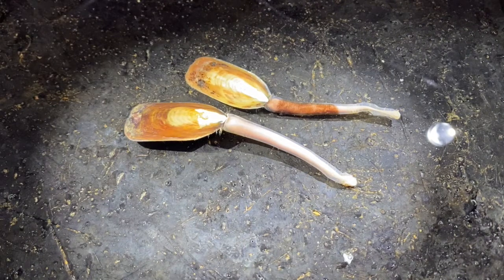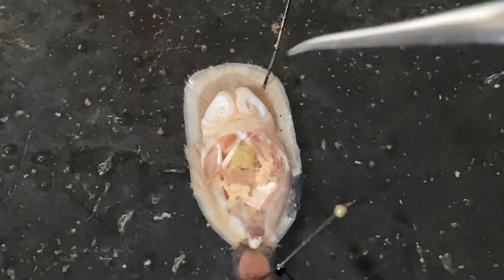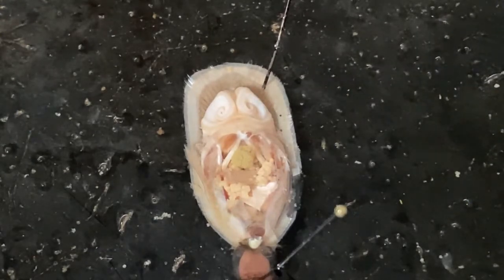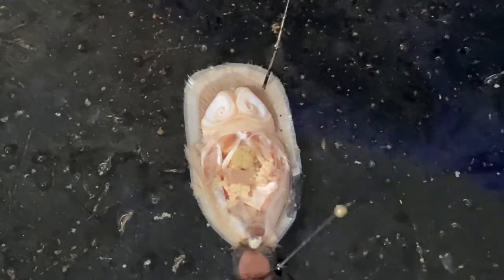All right, now we're going to take a look at the internal anatomy, and so I need to do some prep for that. Okay, to take a look at the internal anatomy, what I've done is remove the ventral shell. These animals, as you recall, have dorsal and ventral shells instead of left and right-handed shells that we find in bivalves. And the lophophore, which is this double coiled structure right here, is always attached to the dorsal shell. And let's just measure the length of the portion that we're looking at right now.